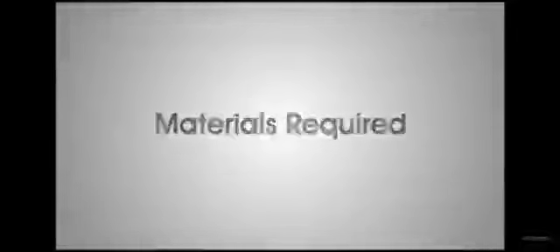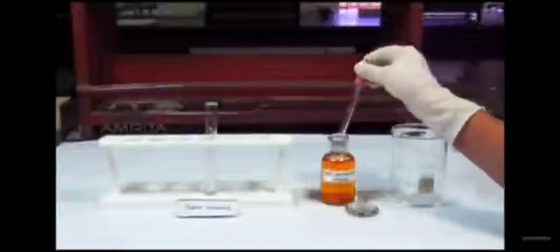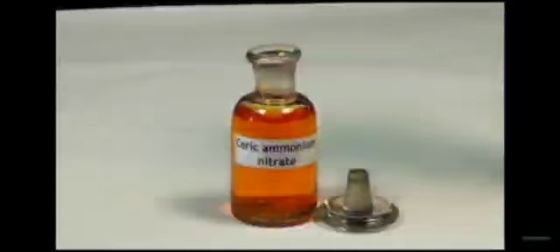Third is the ceric ammonium nitrate test. Materials required: organic compound, ceric ammonium nitrate reagent, test tube and dropper. Procedure. Take about 1 ml of the given compound in a clean dry test tube. Add a few drops of ceric ammonium nitrate reagent using the dropper.